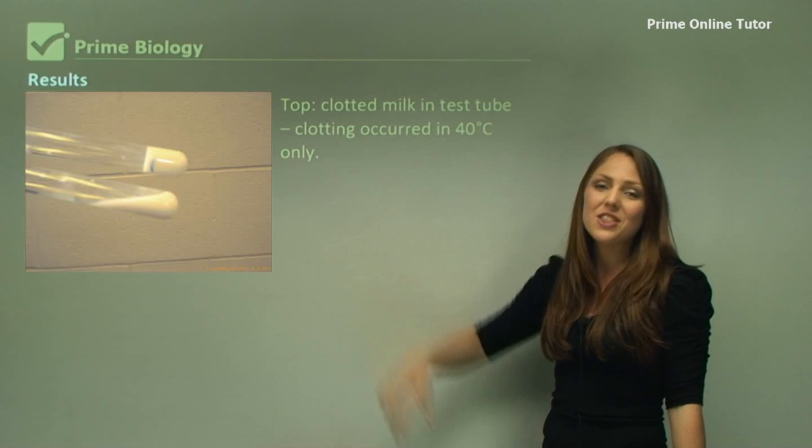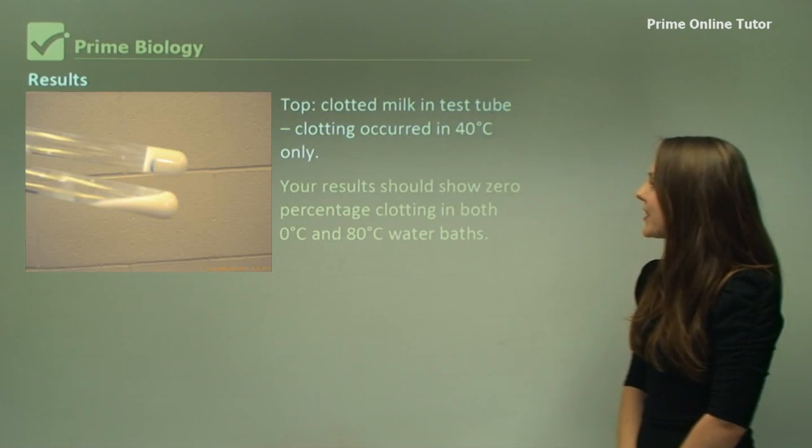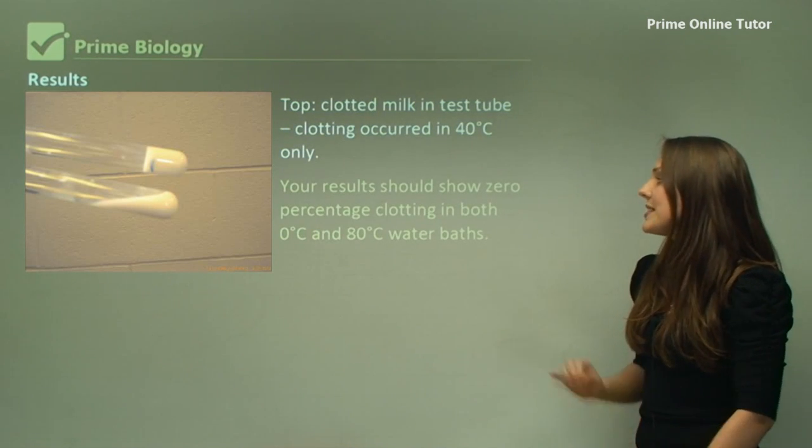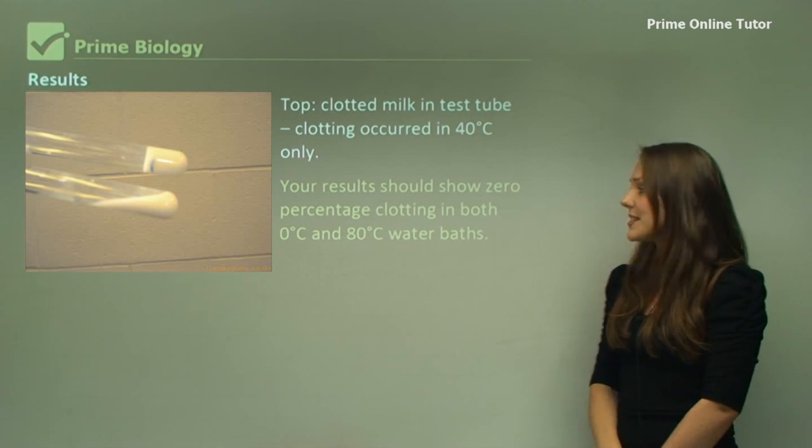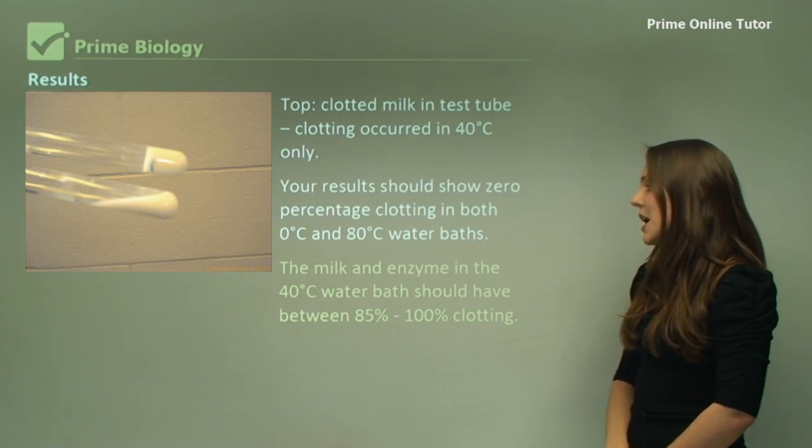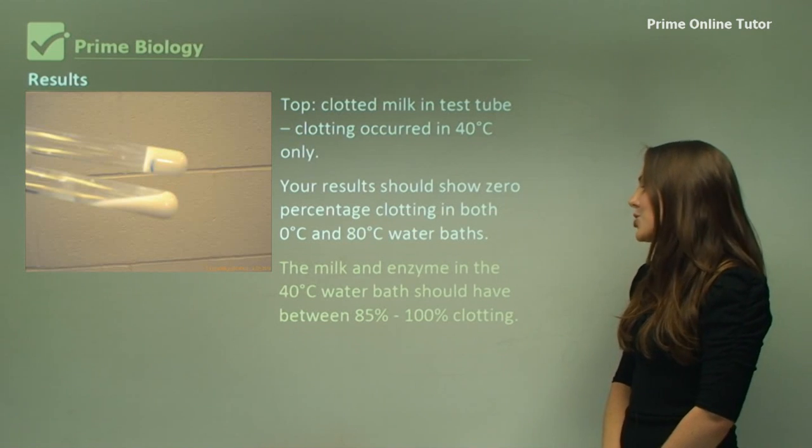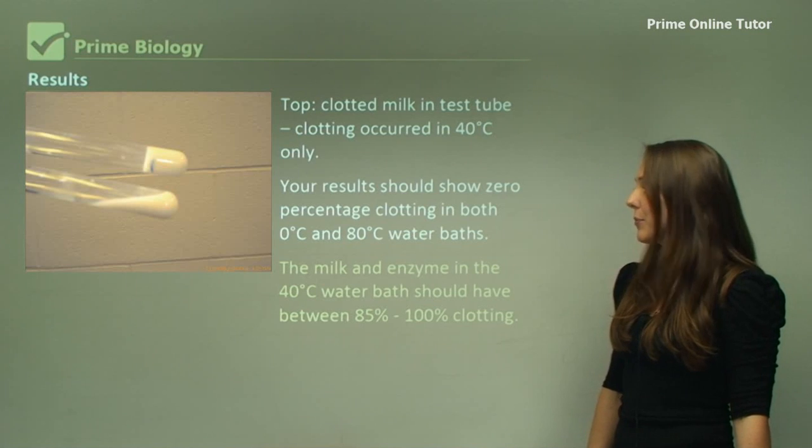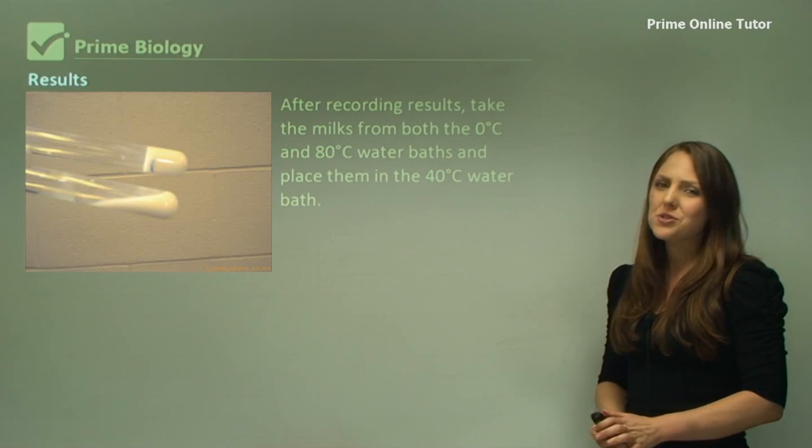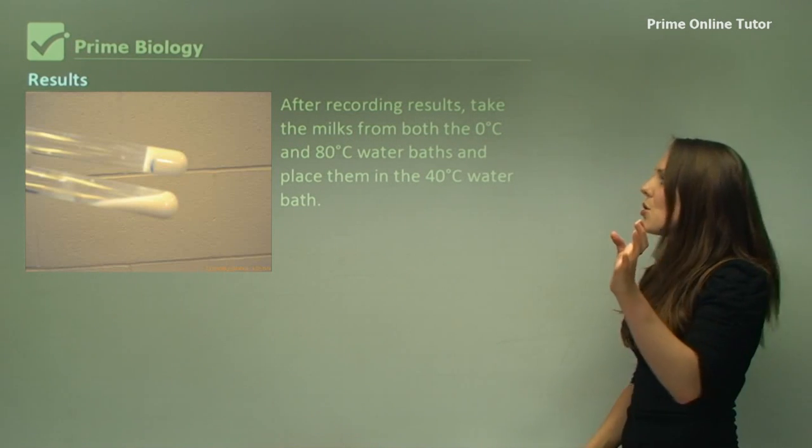Your results should show zero percent clotting in both zero and 80 degrees water baths. The milk and enzyme in the 40 degrees water bath should have between 85 percent to 100 percent clotting. After recording the results, you can then take the milks from both the zero degrees and the 80 degrees water baths and place them in the 40 degrees water bath.